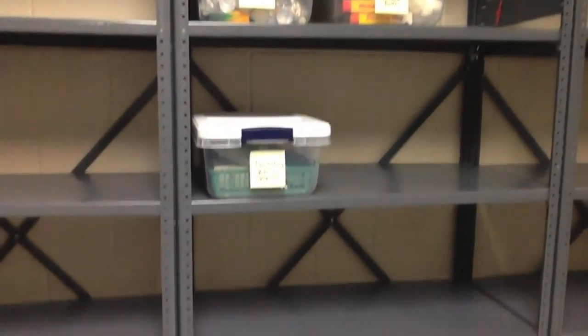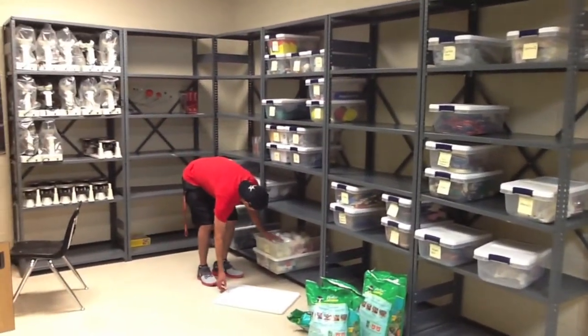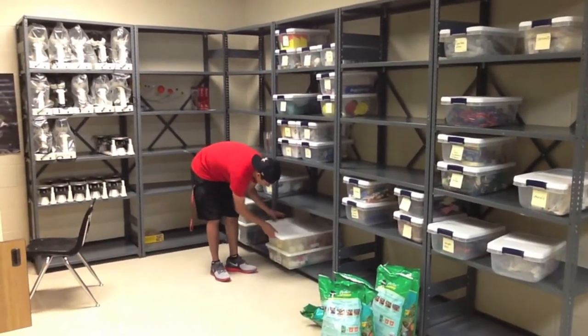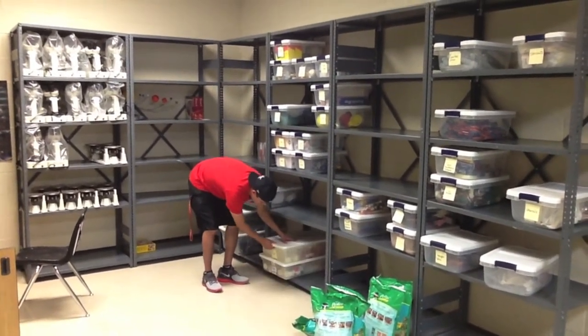Once everything is in a bin, you can start putting these bins on the shelves in alphabetical order. With items that are too big for the bin, we suggest that you designate one area or a set of shelves to house these, like the microscope, soil, triple beam balances, things of that nature.